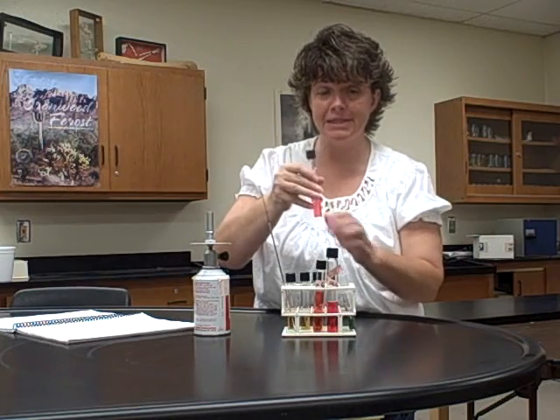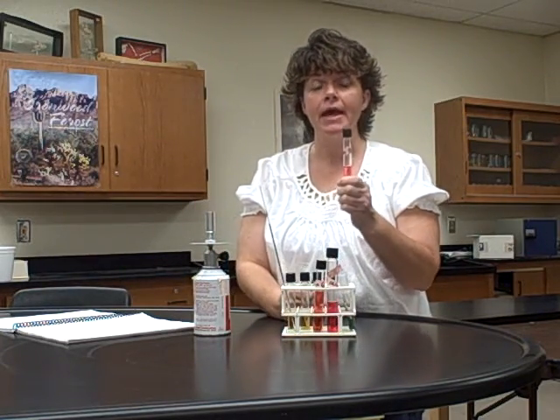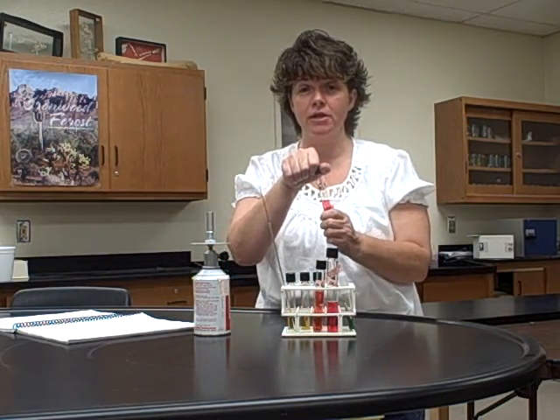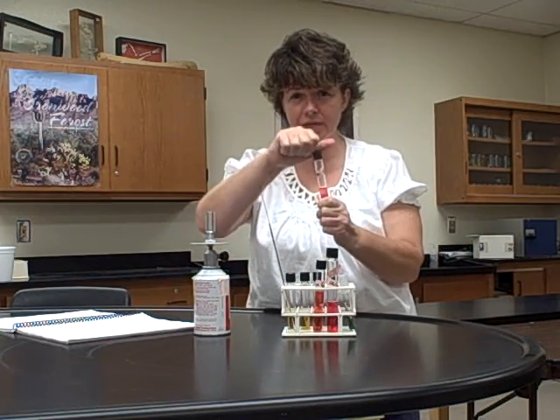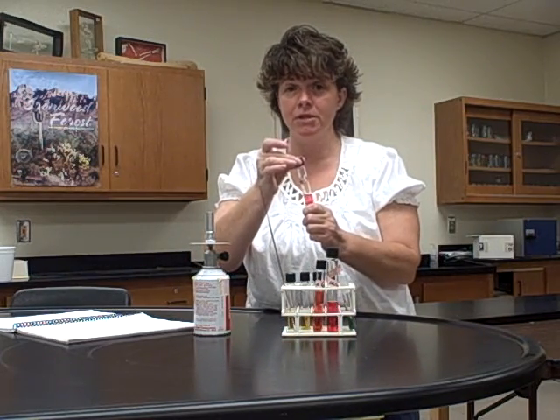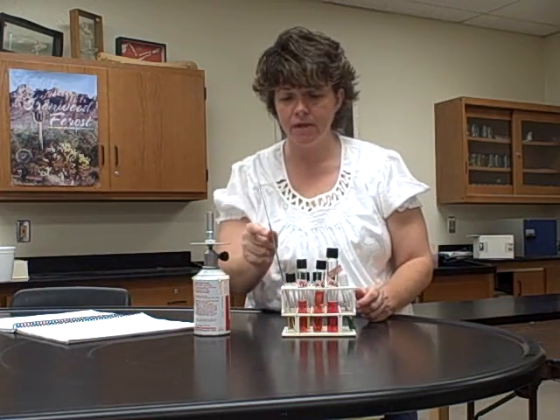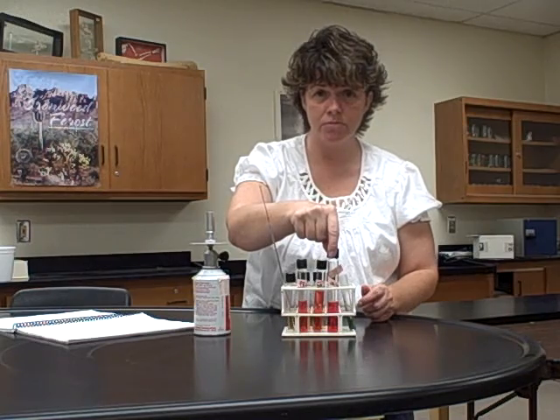Now, one note I want to make is on these screw top lids, you don't want to close them completely tight, because if you do, you're cutting off the bacteria's oxygen supply. And at this point in the lab, unless you're told differently, you want your bacteria to have some oxygen. So what you can do is you can close it to where it closes, not real tight, but it's completely closed, and then give it a turn opening. You don't want it falling off, but you want it to be loose. Okay? We would use that same procedure and put the same bacteria into your other 2 tubes.